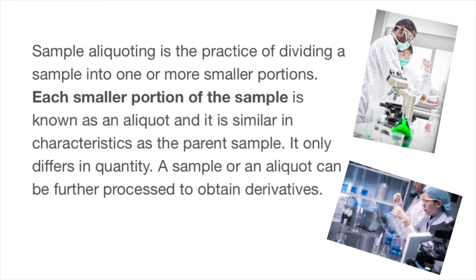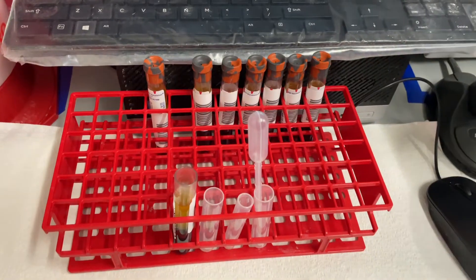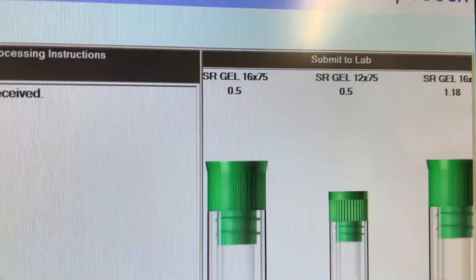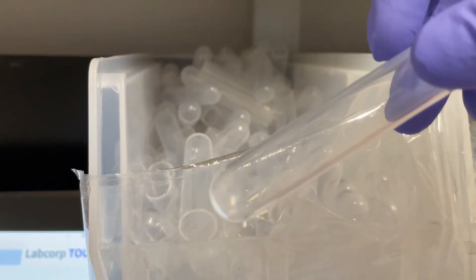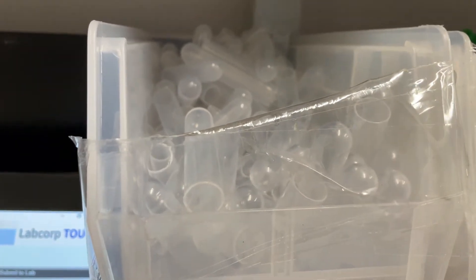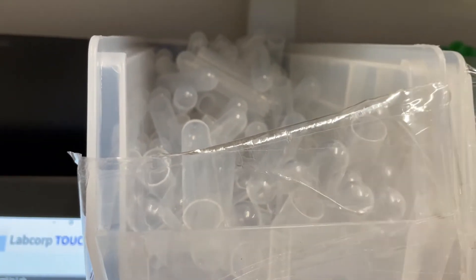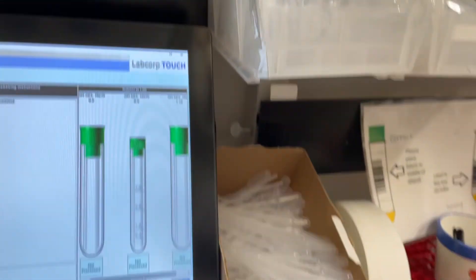You can say pipette or you can say aliquot — the medical term is aliquot. Sample aliquoting is the practice of dividing a sample into smaller portions. Each smaller portion of the sample is known as an aliquot. It says 0.5 for a 16 by 75 tube, so we're going to process it.